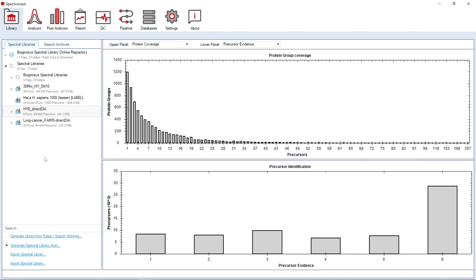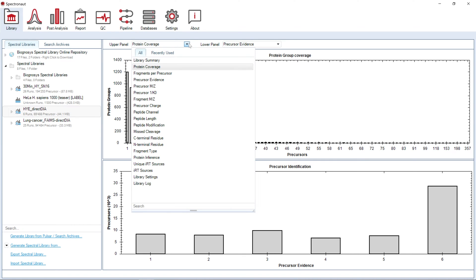In the library perspective, you can generate, upload, and export spectral libraries for any library present. You can visualize multiple metrics to help you understand the depth and coverage of the proteome of interest.